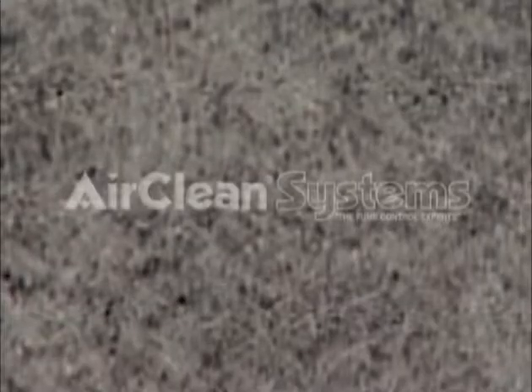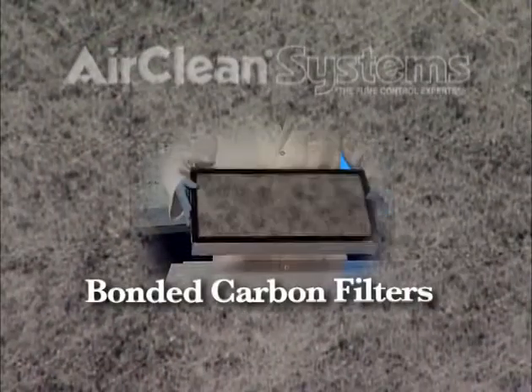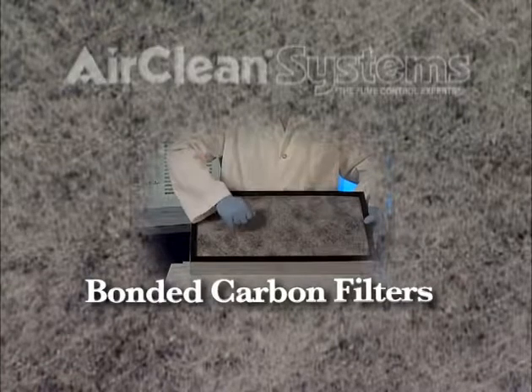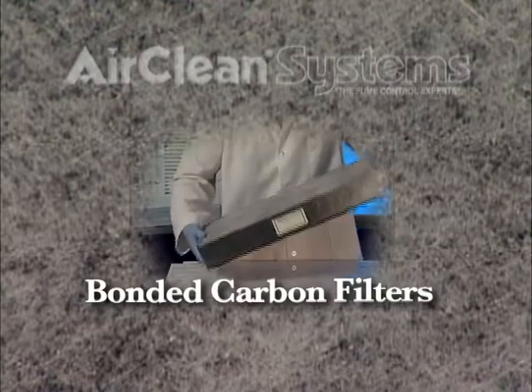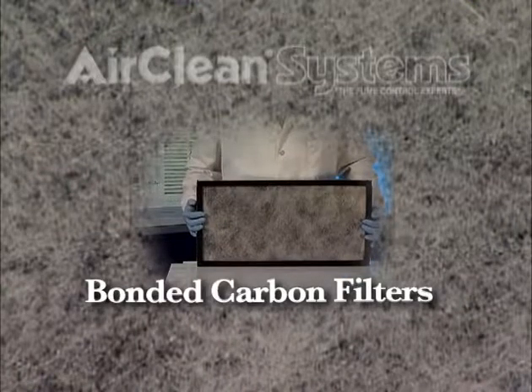AirClean Systems utilizes revolutionary bonded carbon filtration that provides effective containment of toxic vapors, gases, and fumes, while eliminating potential exposure to hazardous carbon dust. Since the carbon filter is bonded, layering of different impregnates can be easily accomplished to handle a wider range of chemistry.